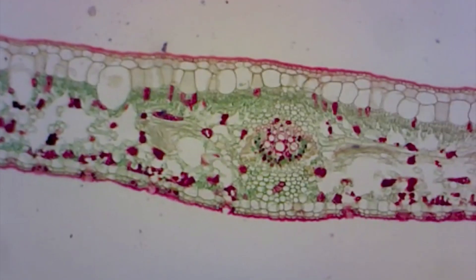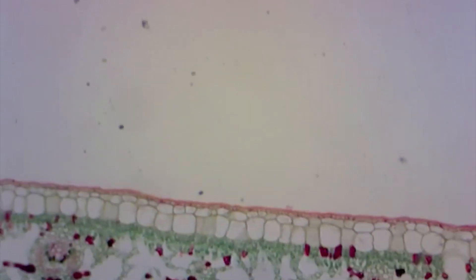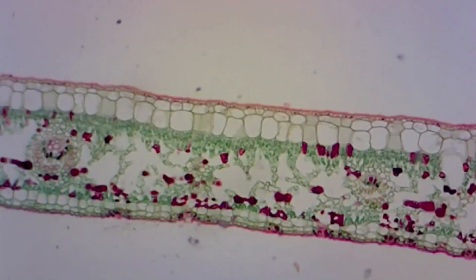When you place a slide on the microscope stage, make sure that you're looking at the flat portion of the leaf, and not the middle where the vein is. Move the slide if you need to find a better spot, and draw what you see on high power.